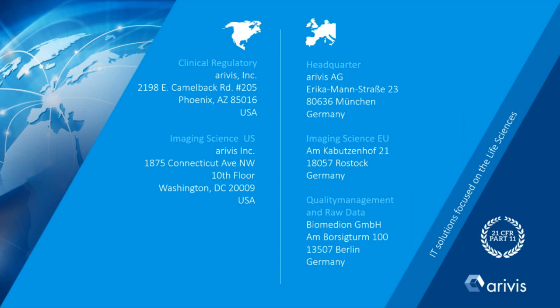Garima asked a question during the live demo of the Arivis Vision 4D. Is it possible to measure the orientation, coherency, and length of the tubulin? So I would say no. Maybe we have to get back to you on what we really can do.